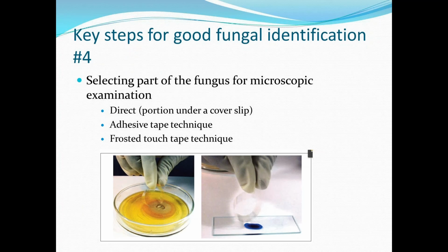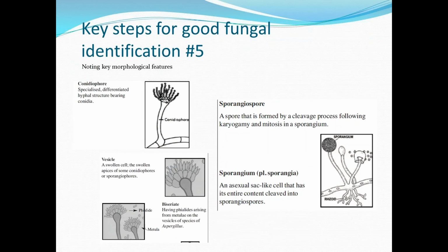We looked at adhesive tape. So clear tape is effective, but it's fiddly, particularly with gloves, and if gloves are not being worn, then there's risk of infection to the laboratory worker. Or there's a touch tape technique, which is the one illustrated, and that requires more skill, but is actually far more effective.